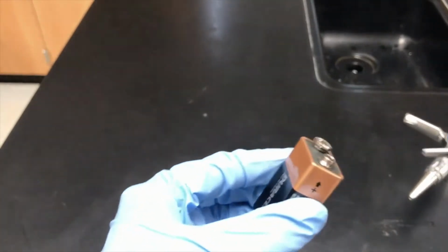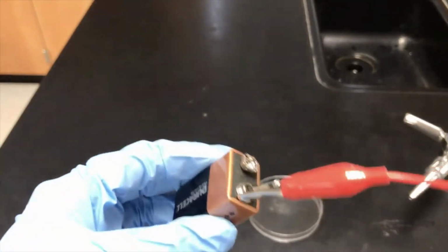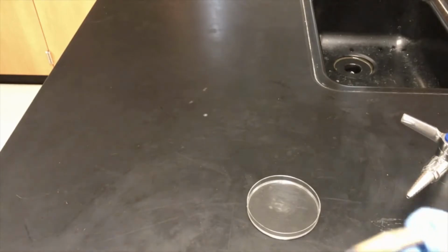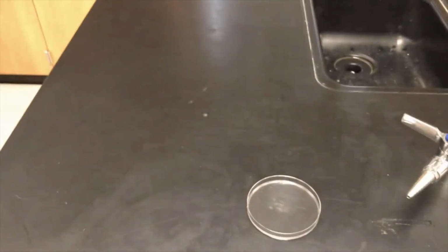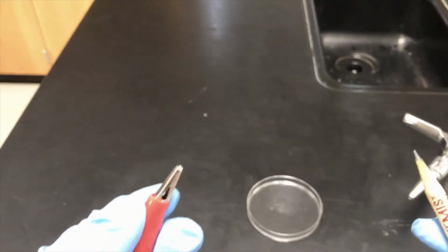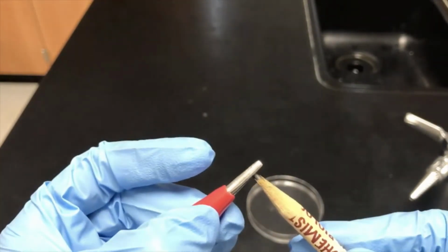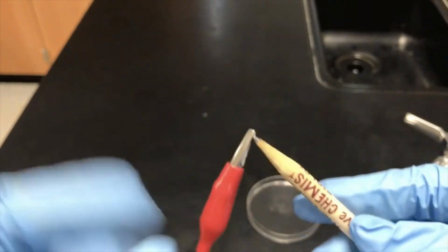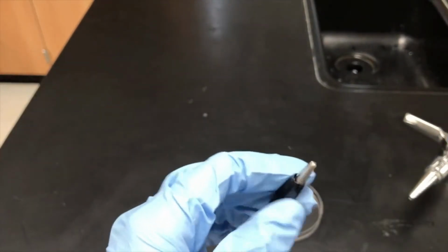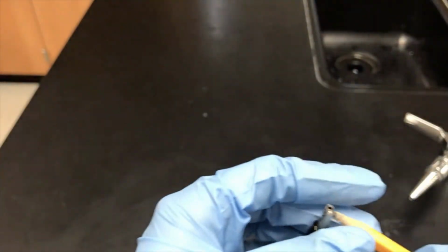So I've got my battery here. I'm going to connect one alligator clip there and one alligator clip there. Now I'm going to connect them to my pencils, to the graphite of the pencils, because while we assume it's just metallic compounds that as solids conduct electricity, graphite, which has covalent network bonding, it's all covalent bonds, that's why diamond is so strong, it also conducts electricity. So it's attached there, and then the black one needs to be attached to the other pencil. Now you'll be doing this in the lab with two new solutions and trying to figure out what's going on. All right?